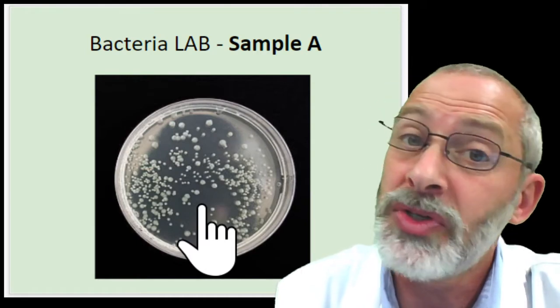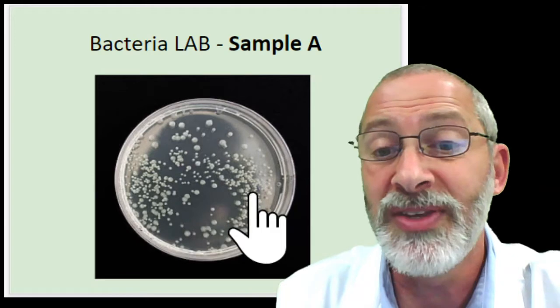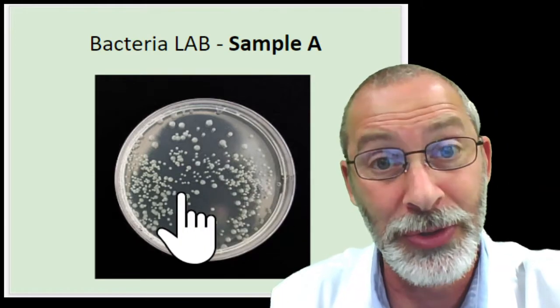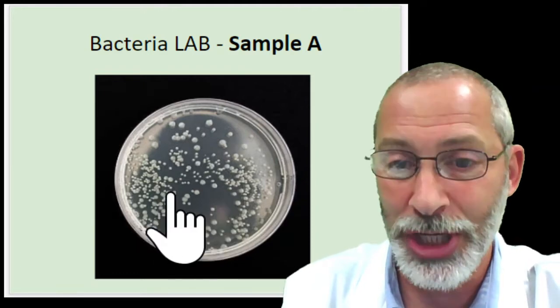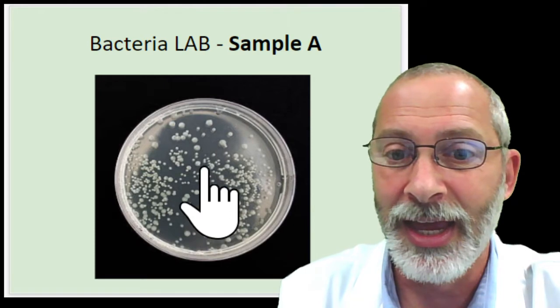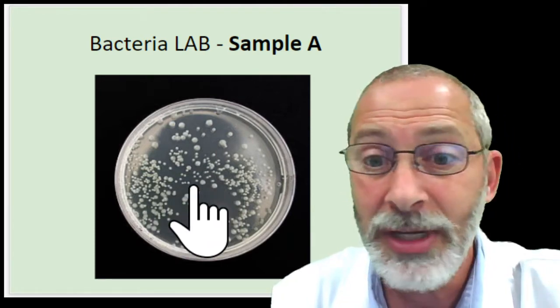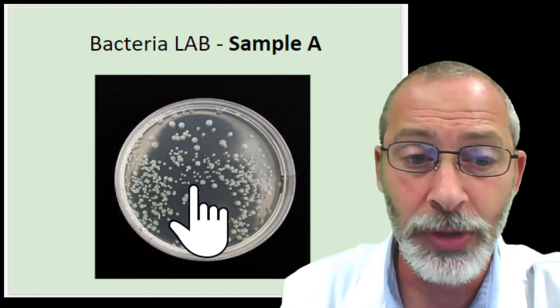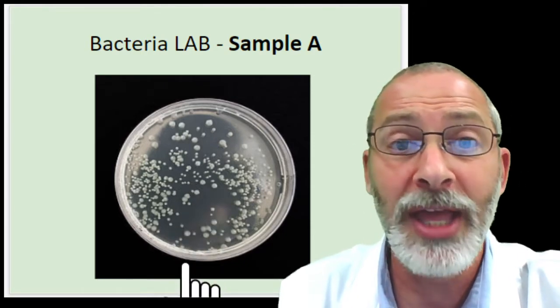So next time you sit down to do your business, think about what business the bacteria are up to right beneath your buttocks. They are flourishing in various colonies like this. And again, this is just a view of the colonies of bacteria, not the shape of individual bacteria.